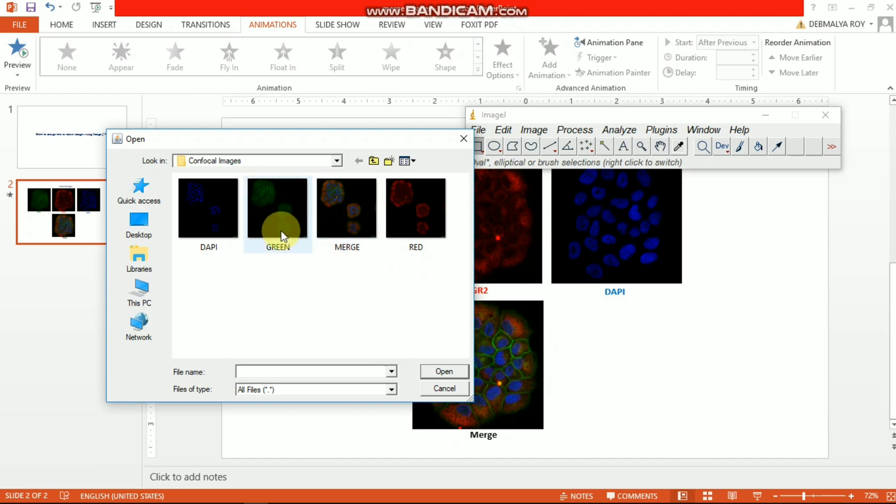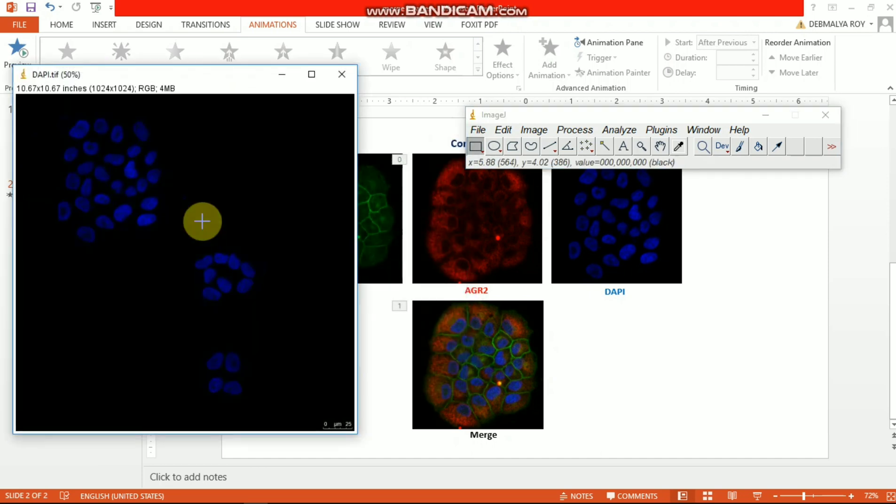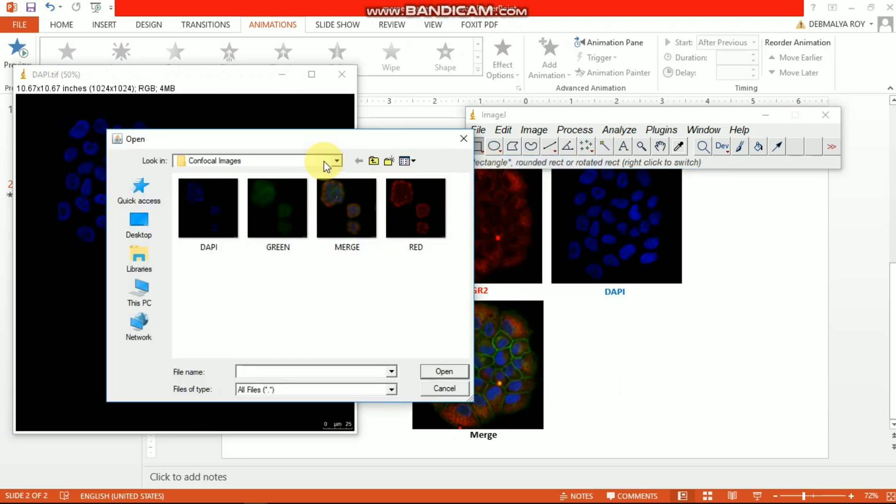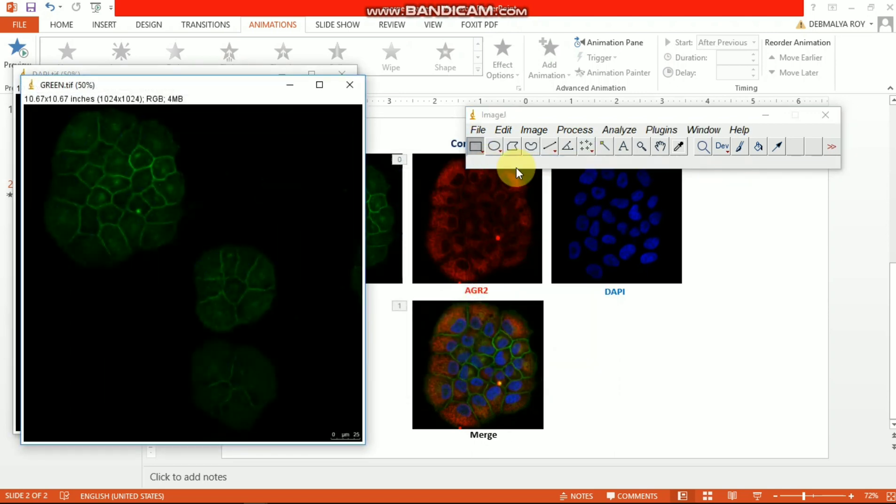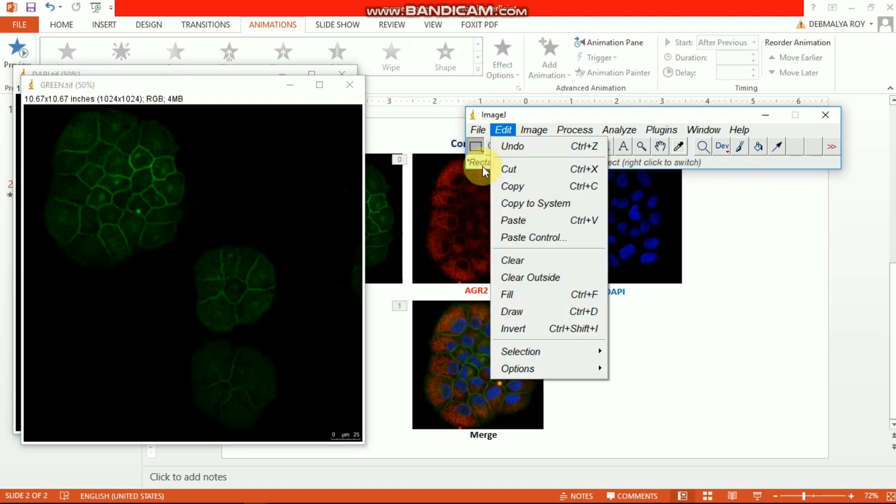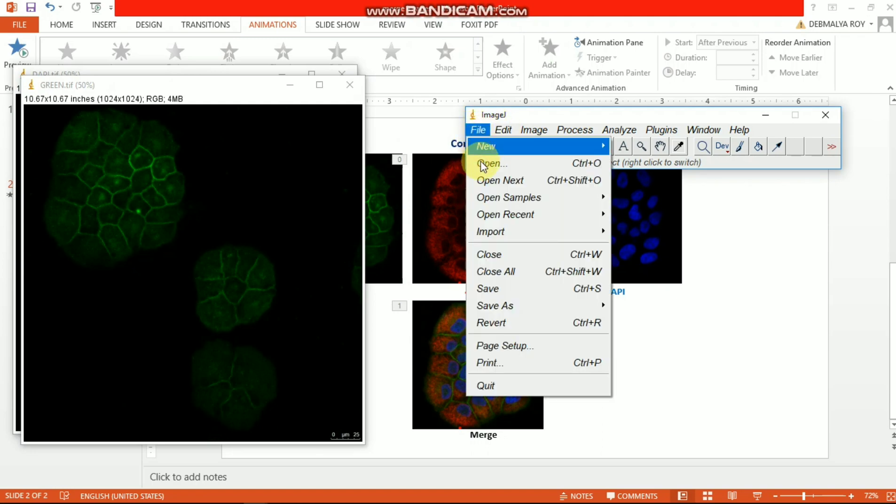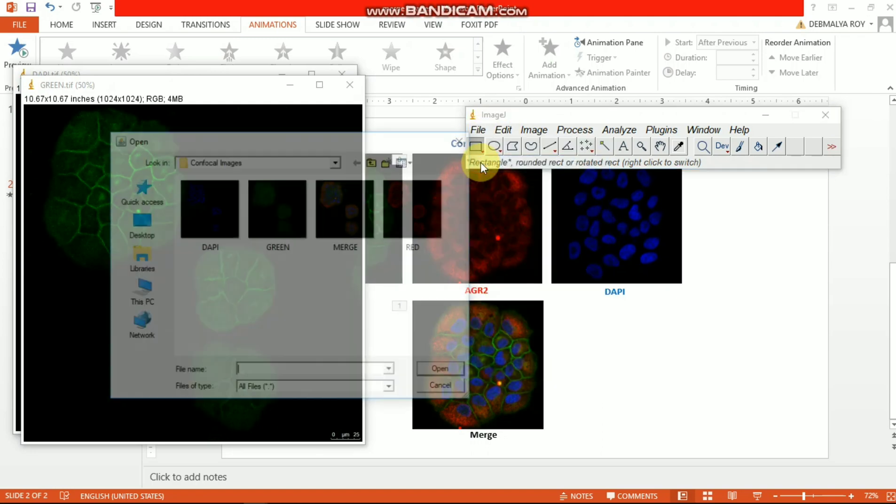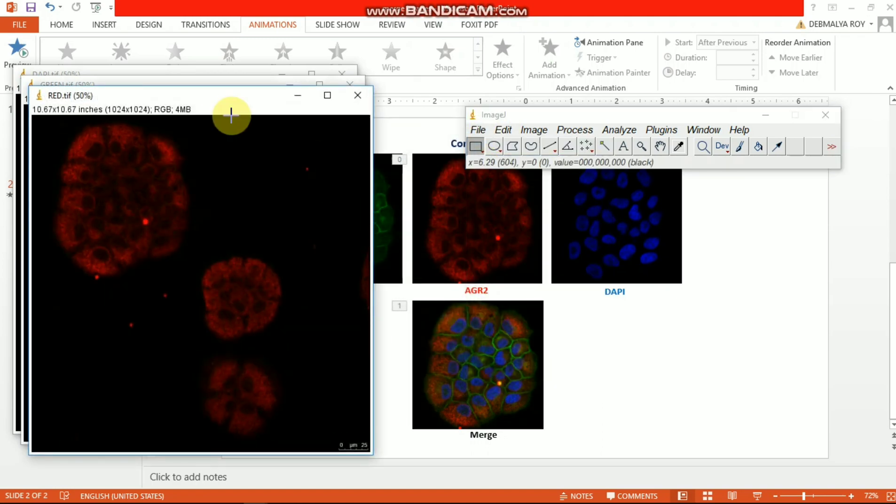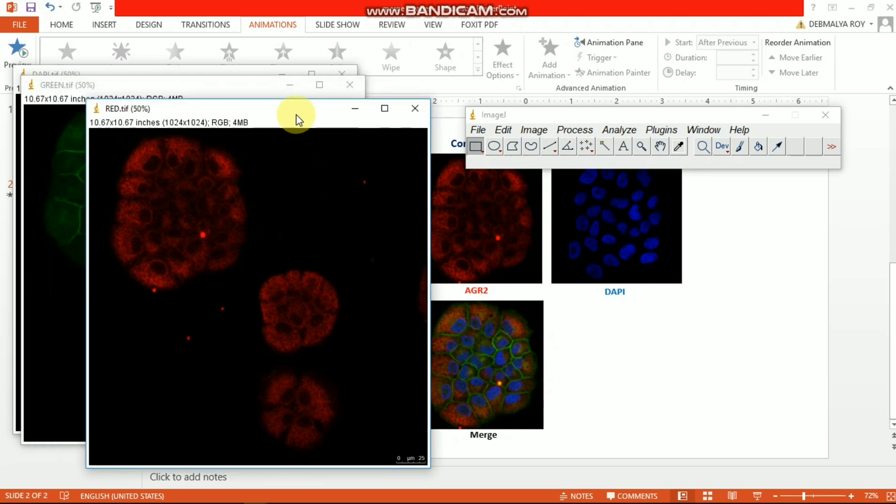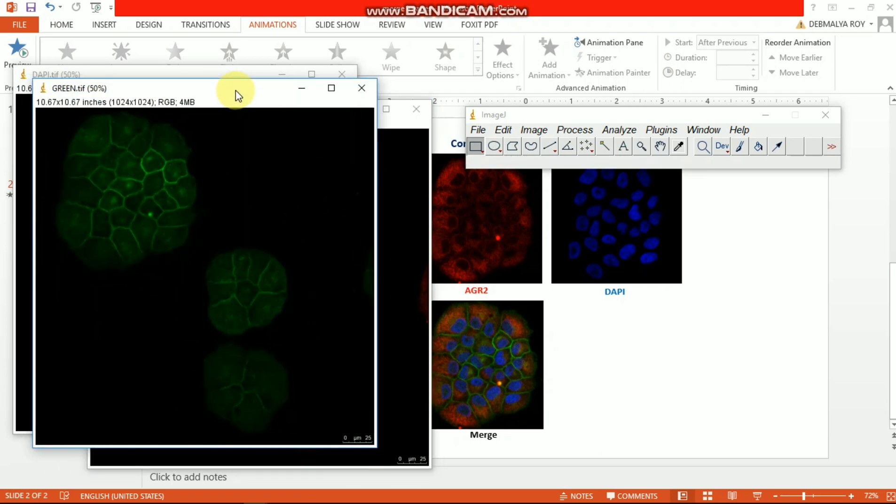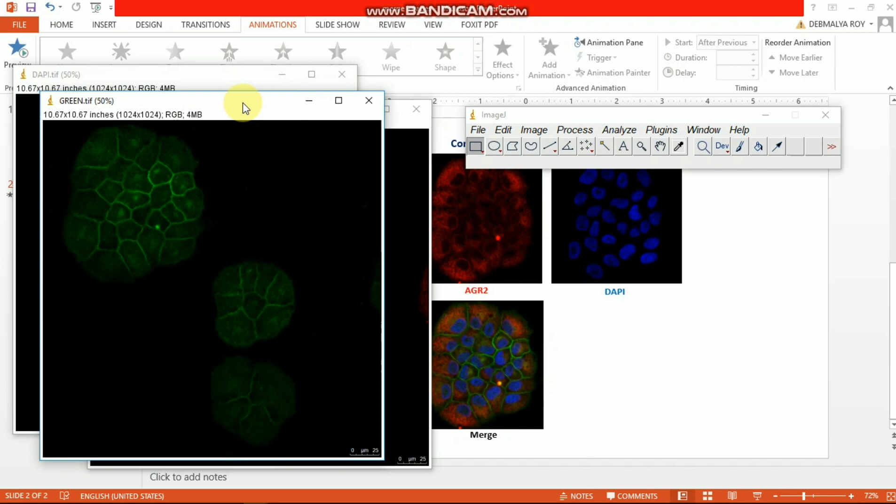Then you need to open your images one by one - green, blue, and then red. So here you can see that three images are already opened. Now you need to merge these pictures.